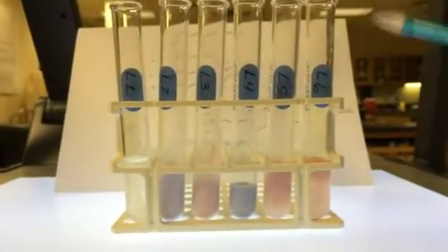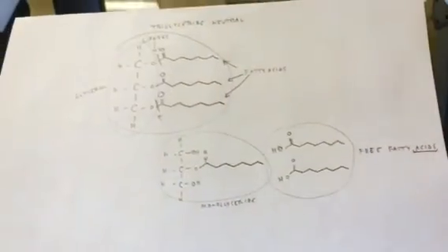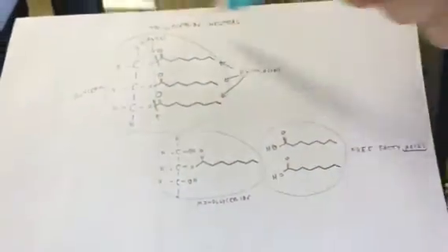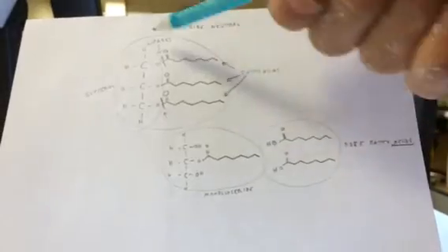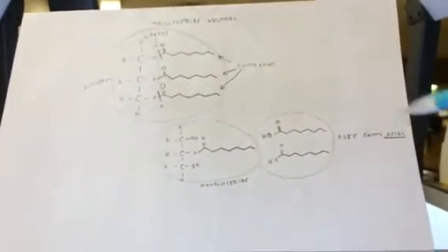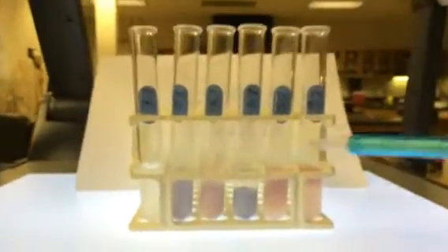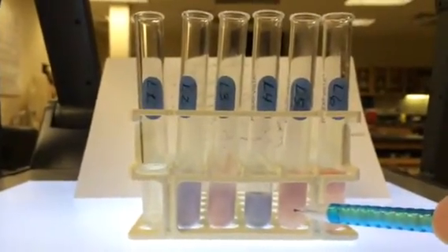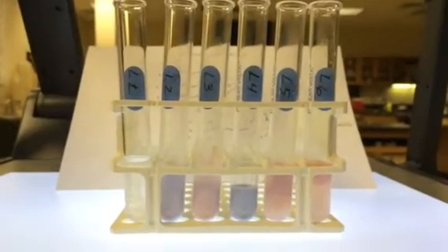So what made this acidic is the free fatty acids. Those triglycerides that made up the fatty component of the half and half were digested by the lipase. That resulted in these acids. And you can tell that by this pink color indicating acidic pH. So we know that the lipases worked.